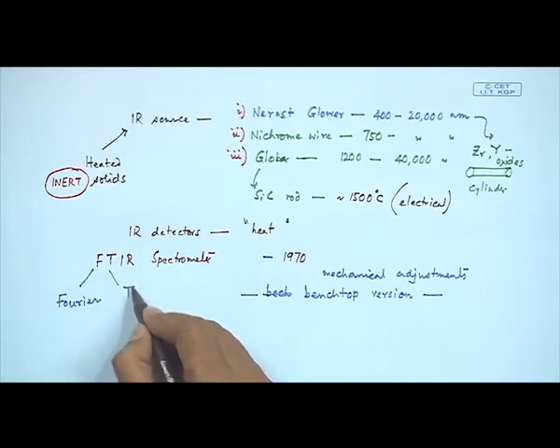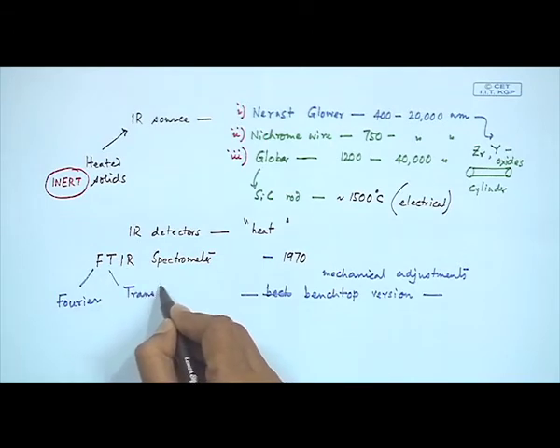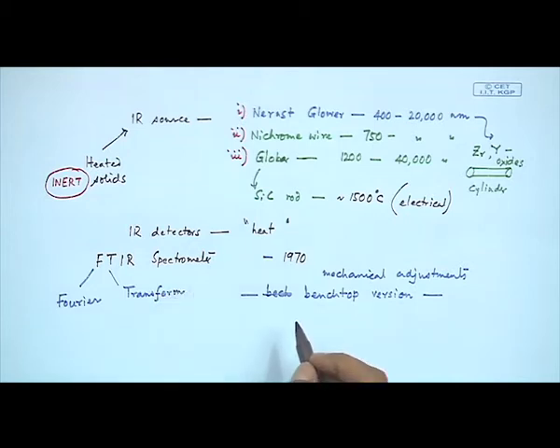Fourier transform. It is a Fourier transform technique, and it is not a dispersive spectrometer. So, no dispersing element is present.